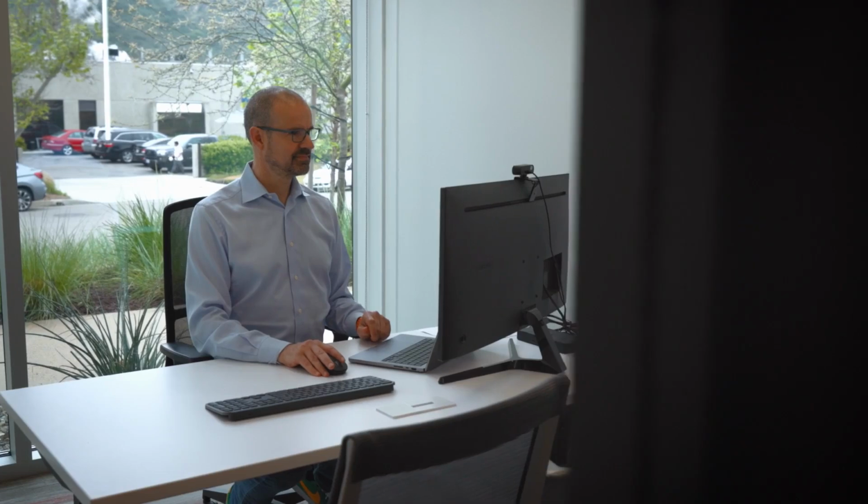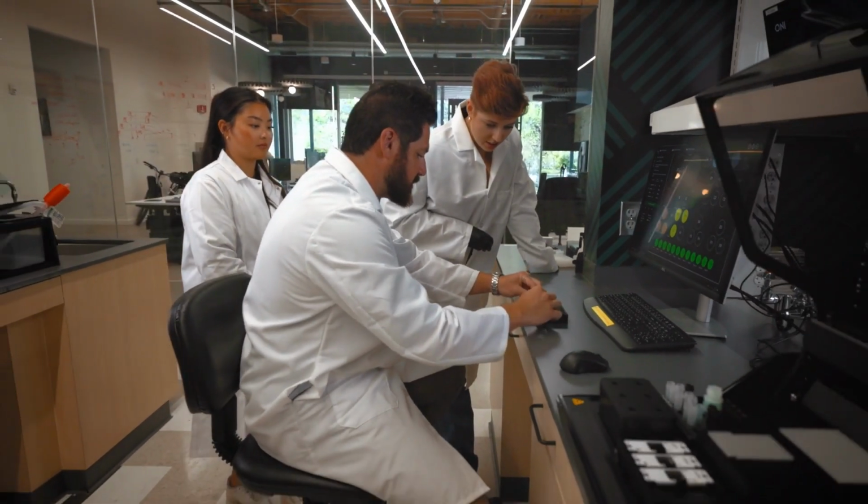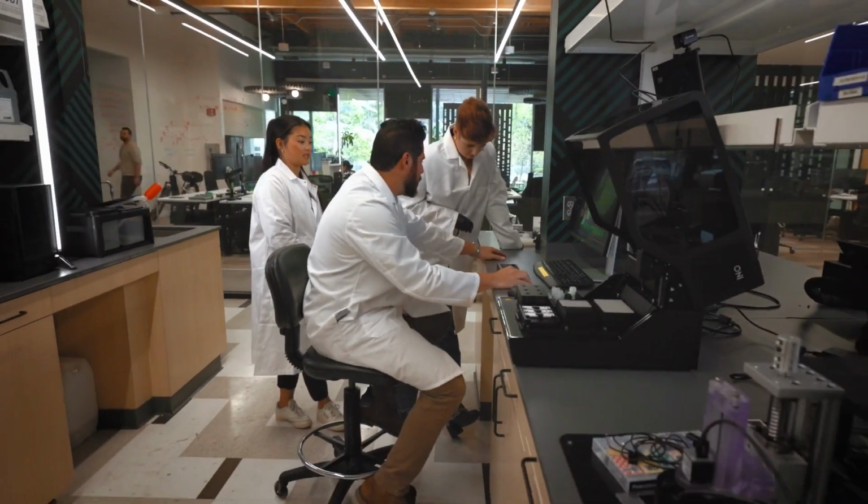For the next year, we're going to broaden the set of things that customers can analyze with our workflows. And think of it as the journey of other techniques that are more mature: DNA sequencing, PCR, other techniques where essentially it's push button, it's end to end. And that's where we're going with super resolution. The innovations over the last year, and those that we're going to be coming out with soon, mean researchers focus less on the method, less on how to get the result, and they focus more on what to do with the results.